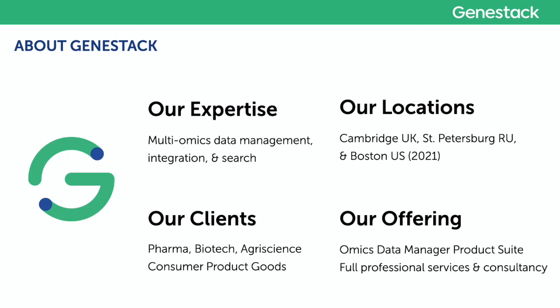Our flagship product, Omics Data Manager, is the culmination of our collaboration with industry leaders. It provides the top integrative multi-omics data management platform on the market. We also provide full professional services and consultancy along our journey with our clients.